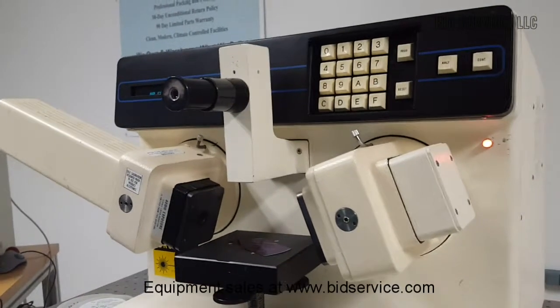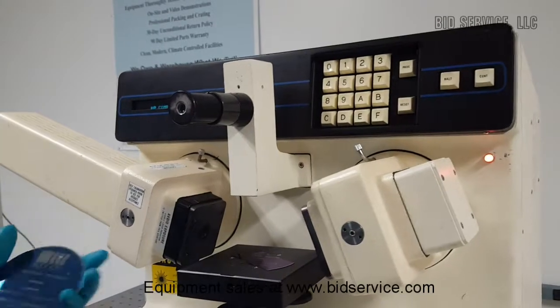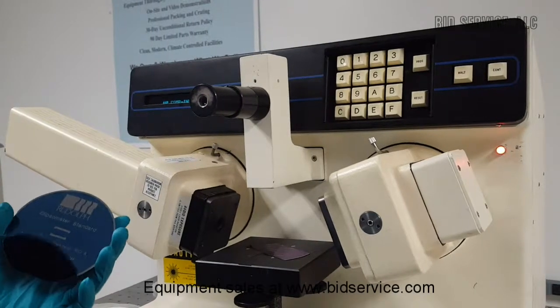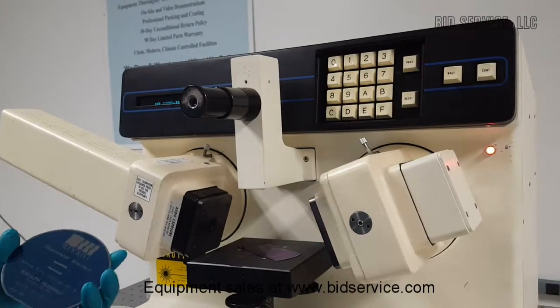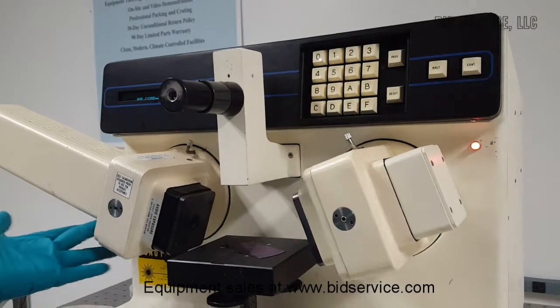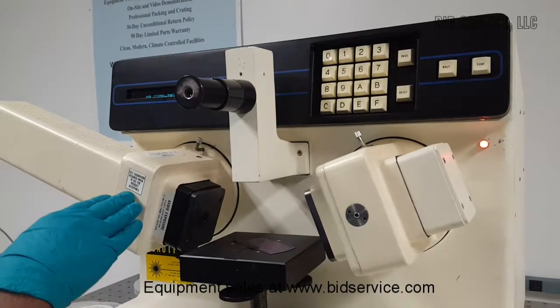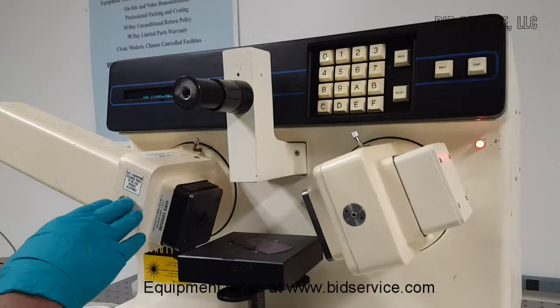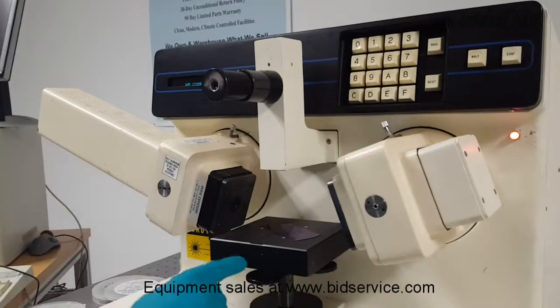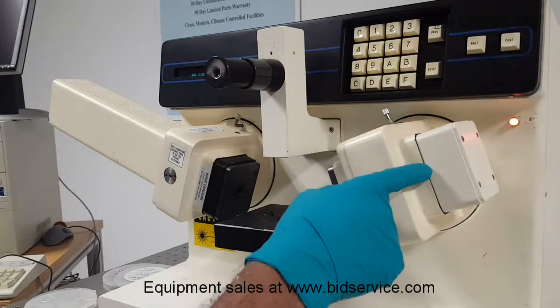Rudolph Research AutoEL-3. It's useful to measure film thicknesses in non-contact mode. The system is based on ellipsometric thickness measurements. There is a laser source in the unit and a polarizing prism here. The beam bounces off the sample, which is located on this table. There's an analyzer on this side and a detector.